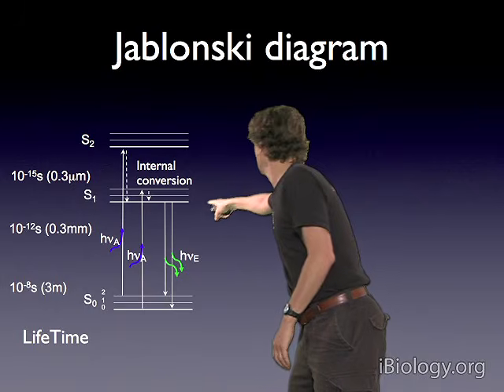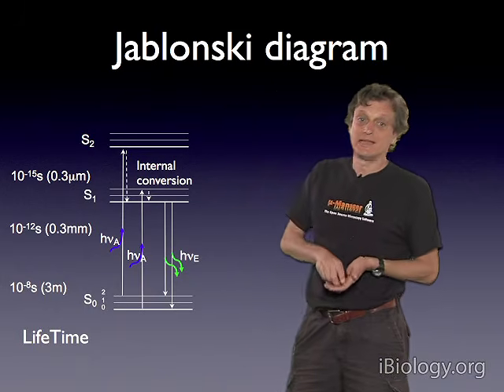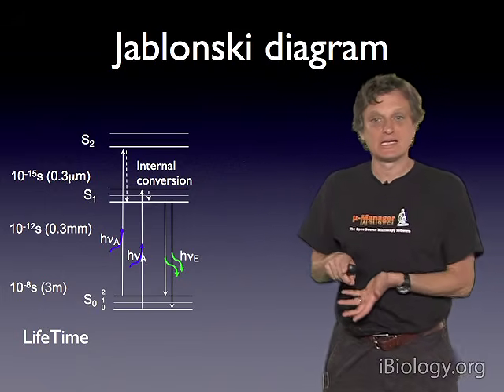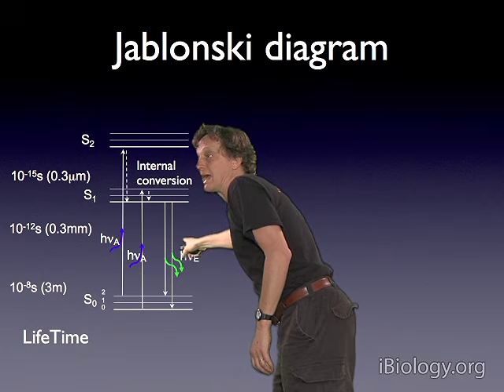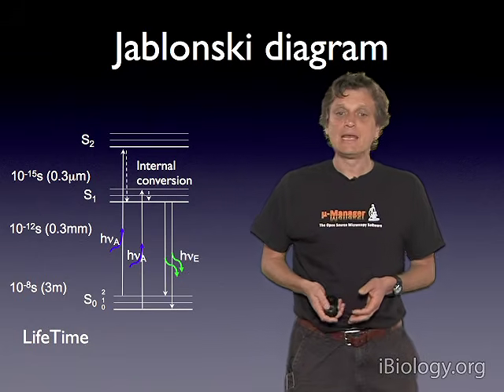And that photon will be of an energy that is less than the energy that was put in initially. And that means that the photon that's coming out is going to be of a higher wavelength.